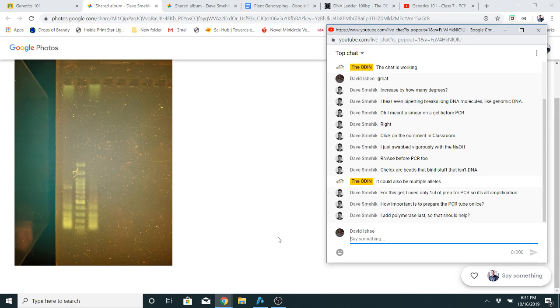So you can use additives, you can change time and temperature and the quantity of things, and if you're really doing sort of advanced stuff, you can change things like how many actual nucleotides are in your reaction, and the chemistry of the master mix. Typically, I don't mess with that, so there's enough dials to be turning already.